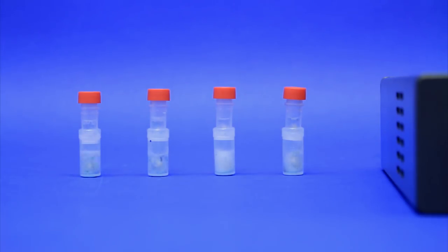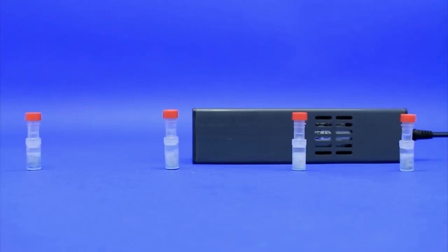This video shows four vials mixing simultaneously, but many dozens more can be positioned around the stir device.